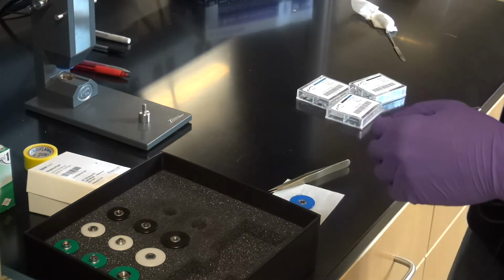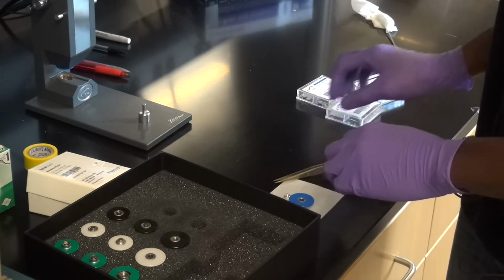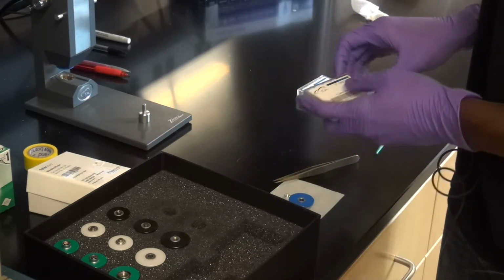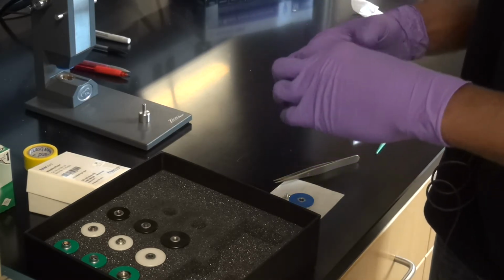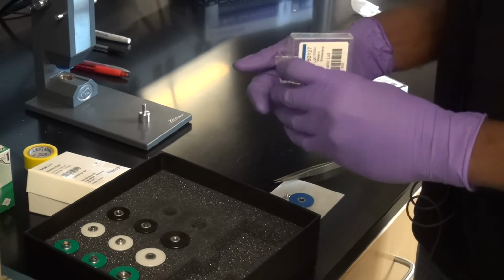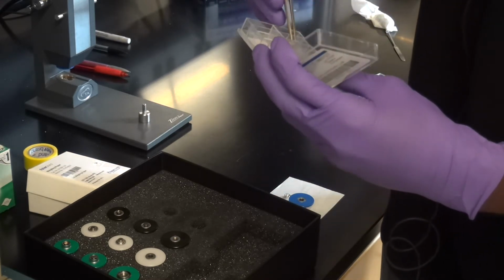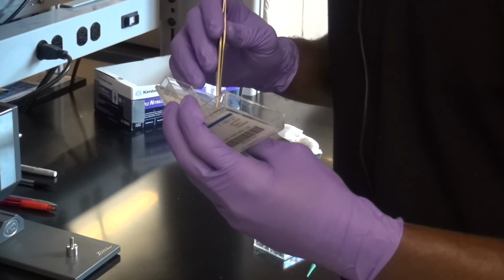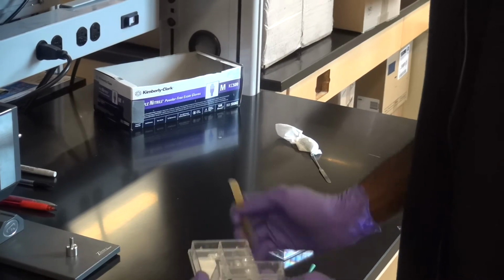Okay? So now I'm going to use the same bottom pan as a demonstration. Again, the bottom pans take both colors. Now I'm using blue, and I want a blue lid. It says T0 hermetic lid, and these lids are pretty flat, so it's very easy to take up 2 or 3 of them at a time. So be sure that you're actually just picking one up. So you take one, you can place it right there.